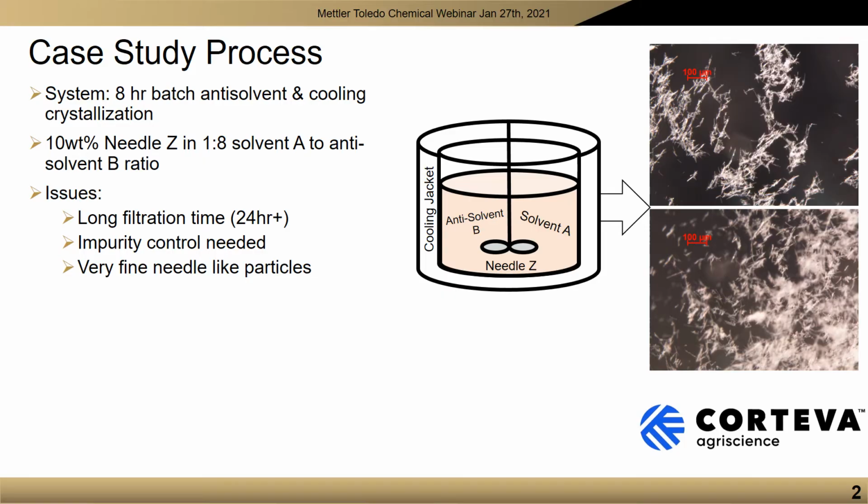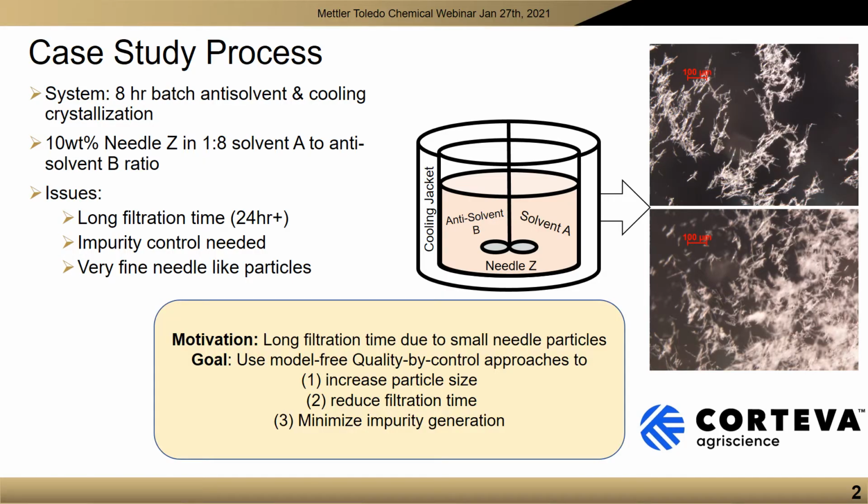It should be noted that impurities are generated during the crystallization process. The motivation for this work is to design a model-free QbC methodology to design a crystallization process that can increase the particle size, which can reduce filtration time while minimizing impurity generation.